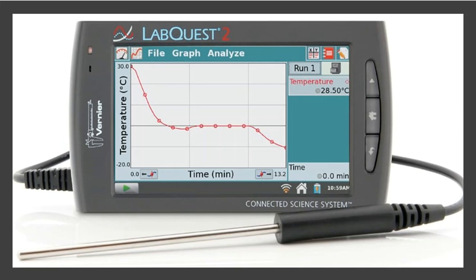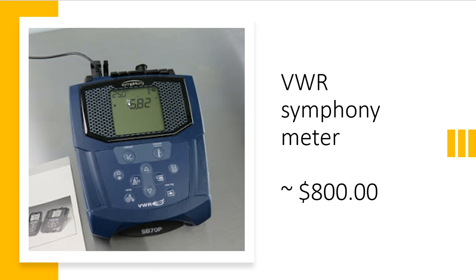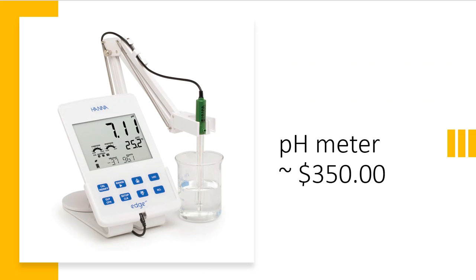All right. So again, just some terminology. This piece is called the probe, and this piece is called the meter, right? The VWR image. This is the pH meter, and what's connected to the meter is going to be the probe. And then the HANNA pH that you're seeing here, same deal, folks. This is your meter, and this is your probe. A lot of people get those confused, and that's why I'm stressing that.